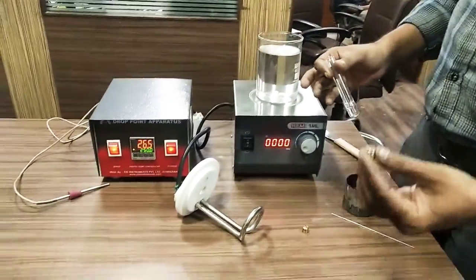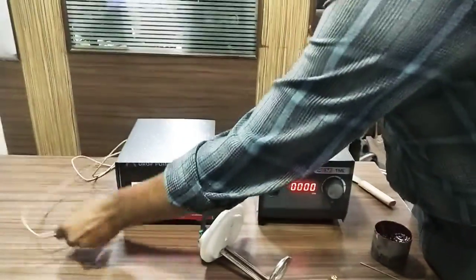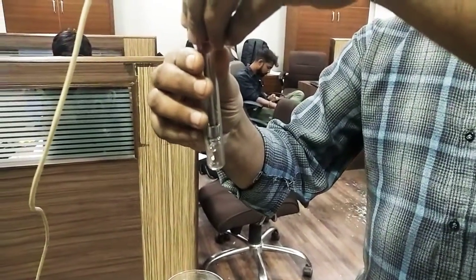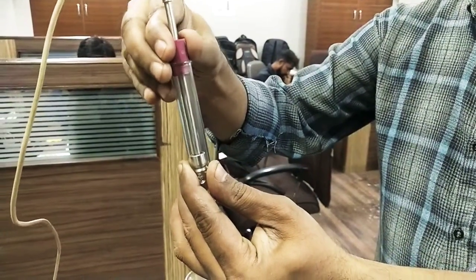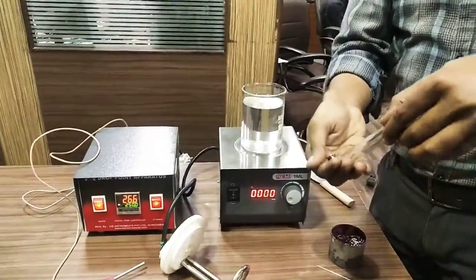First of all we have to put the depth gauge in the test tube, and then we have to adjust the sensor according to the depth gauge. After touching the depth gauge, we have to remove the sensor and remove the depth gauge.